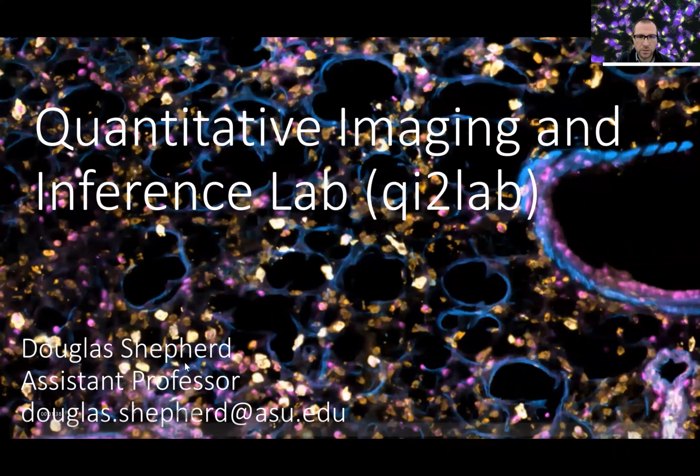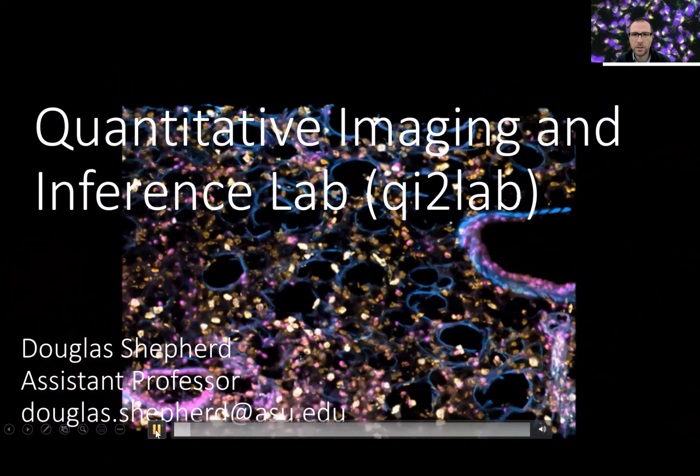So overall, if I had to sum up our research goals, it's that we're interested in building novel microscopes and fluorescence microscopy methods to then try and probe the way that molecular biology is regulated from a physics first perspective. So we can build this up in lots of different ways. We can start at the individual molecule level, or we can start at the cellular level.